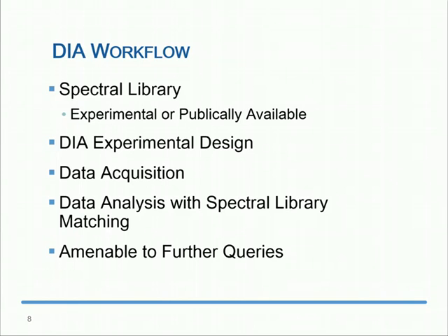And the nice thing about DIA workflows is rather than having a very specific set of peptides sampled with tandem mass spectrometry, you have a broad acquisition of your tandem mass spectra that's amenable to further queries. So as we develop, for example, a database of all the mutant peptides that might be relevant to cancer, you could come back and query the existing data sets to see if you're able to observe those peptides.